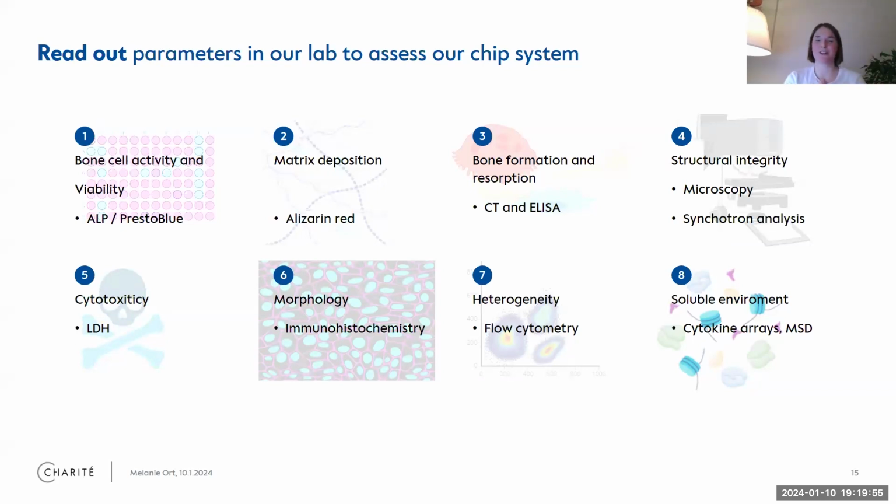We monitor cytotoxicity with LDH release. It's an enzyme. I show that later as well. Morphology, immunohistochemistry. We look at the heterogeneity of the immune cells especially, and then again the soluble environment, like cytokine arrays and MSD, if you know this platform.